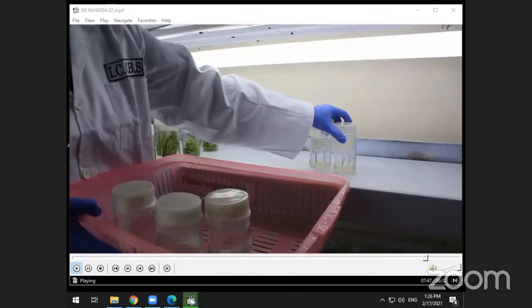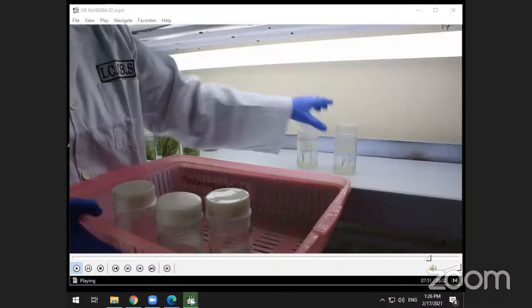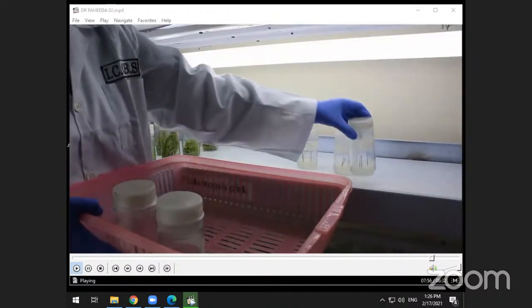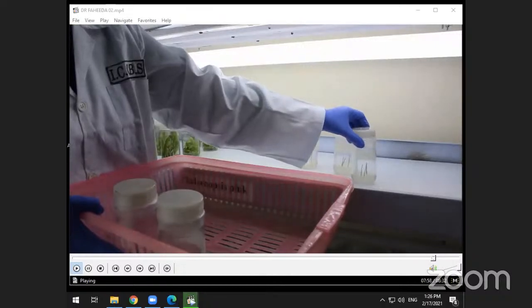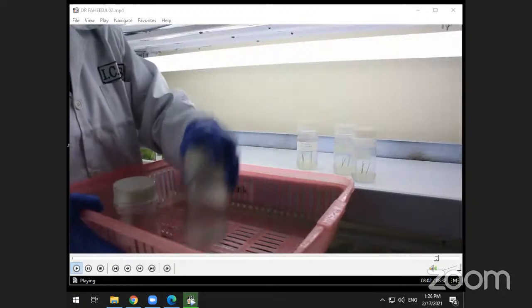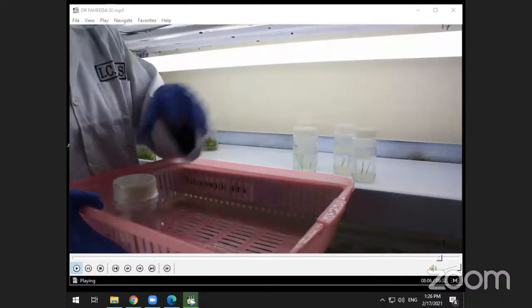Transfer the jars in growth room under illuminated condition of 16 hours of light and 8 hours of dark at a temperature of 24 degrees plus minus 1 or 2 with relative humidity of 40%, and keep visiting your growth room to check any sign of contamination in your culture jars.